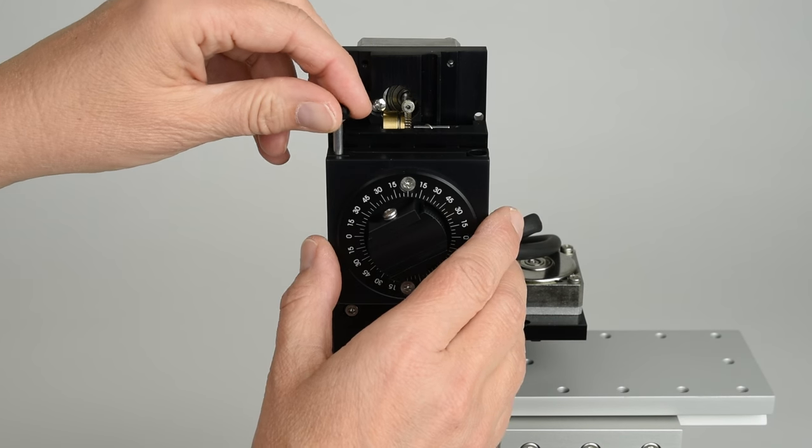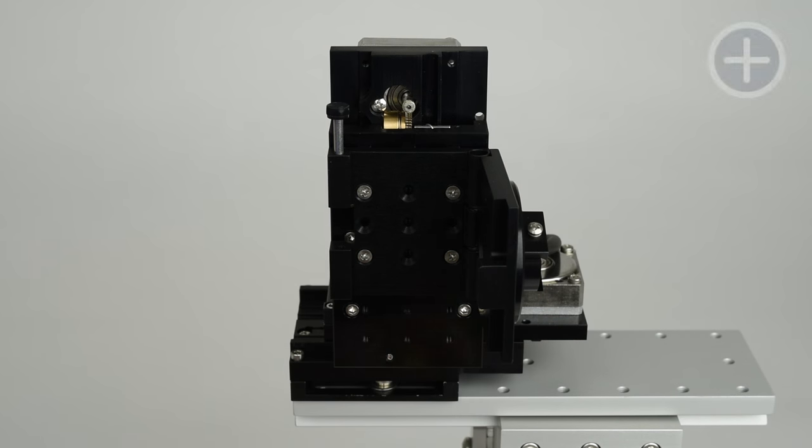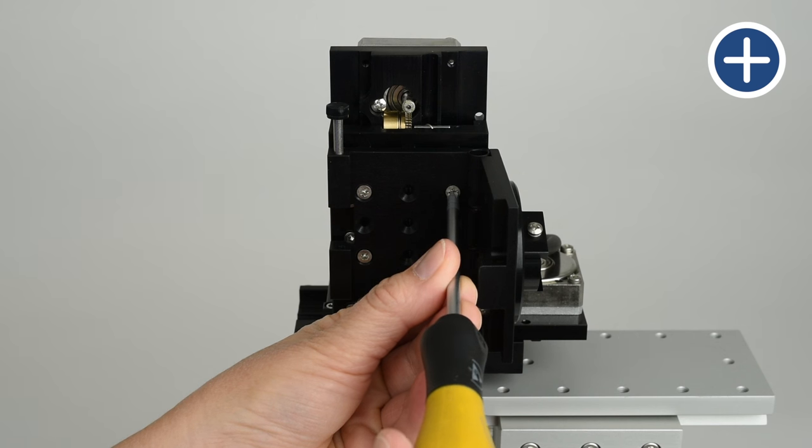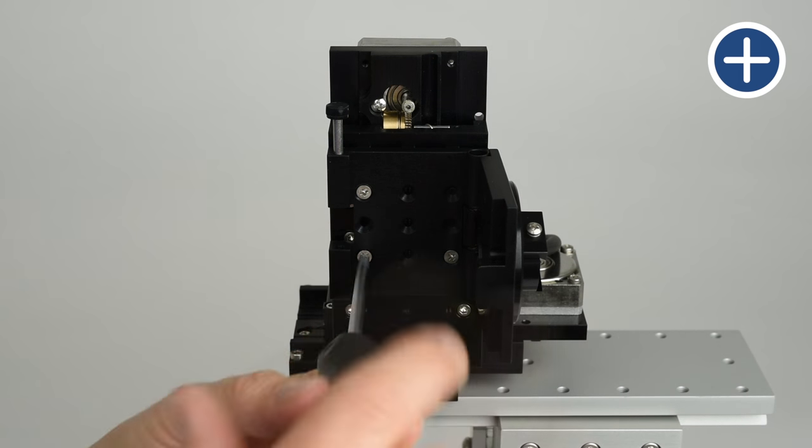First, remove the swing gate from the front of the manipulator by removing the four Phillips screws that attach the swing gate to the manipulator.